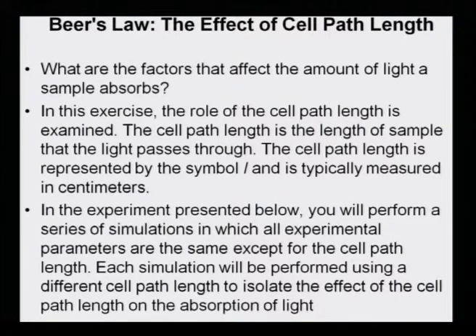So, the cell path length is very important, because if the cell path of the sample and the analyte are varied, the results cannot be compared. It cannot be a validation or a calibration method if the cell path is not kept constant.